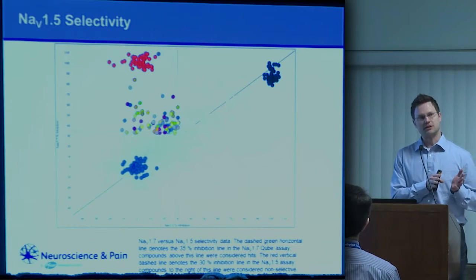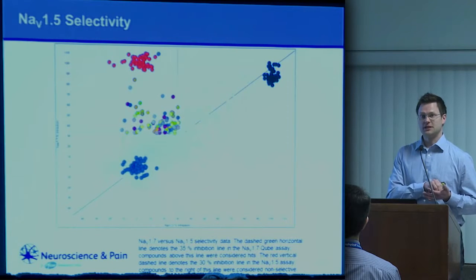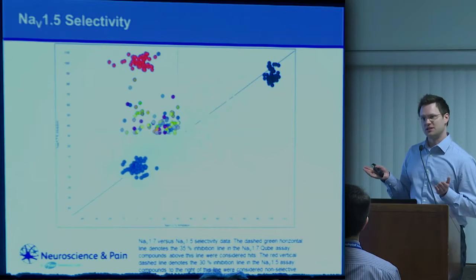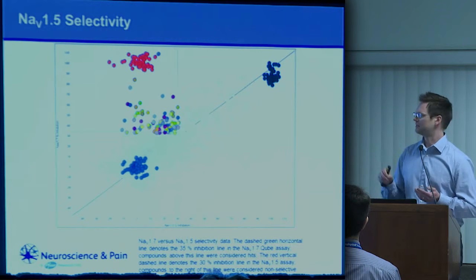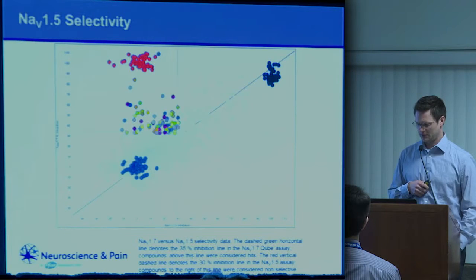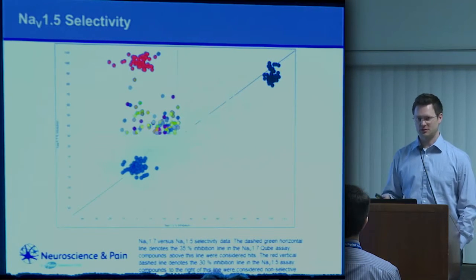Because one of the libraries that we tested was an ion channel focused library, that selective set of compounds actually contains previously tested known selective Nav 1.7 inhibitors. So this dataset actually in a way validates our HTS. We were able to pick out those known Nav 1.7 selective inhibitors. But there were also novel structures in there, which was quite interesting for the chemists. And for me meant that automated ephys would be able to pick up compounds different from previous HTS technologies.